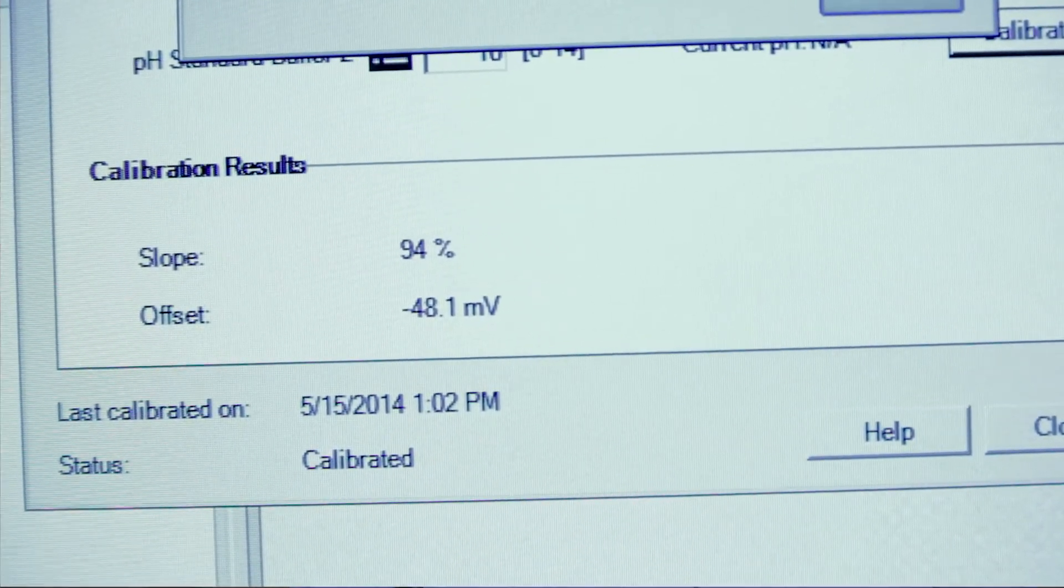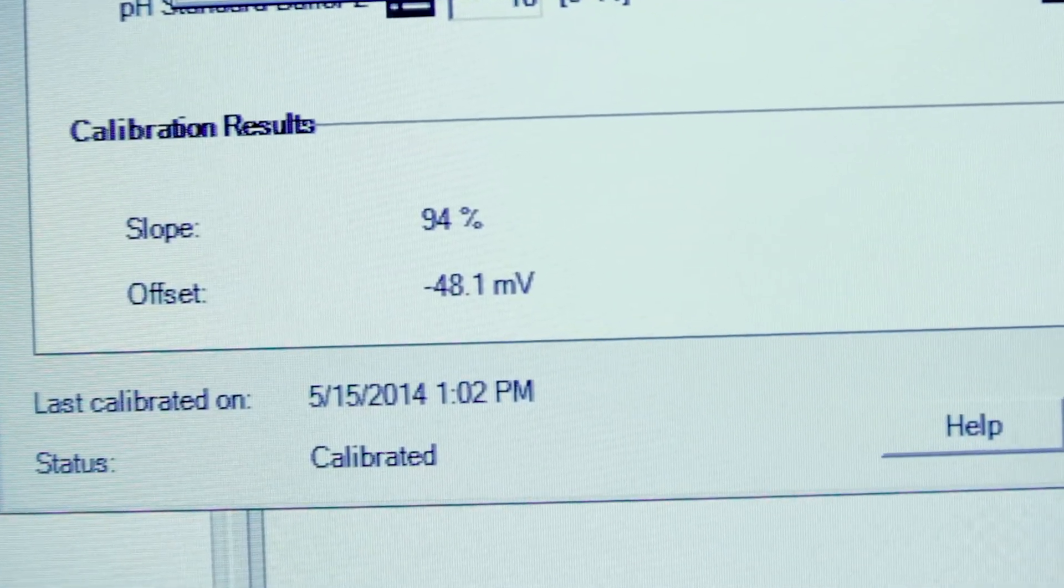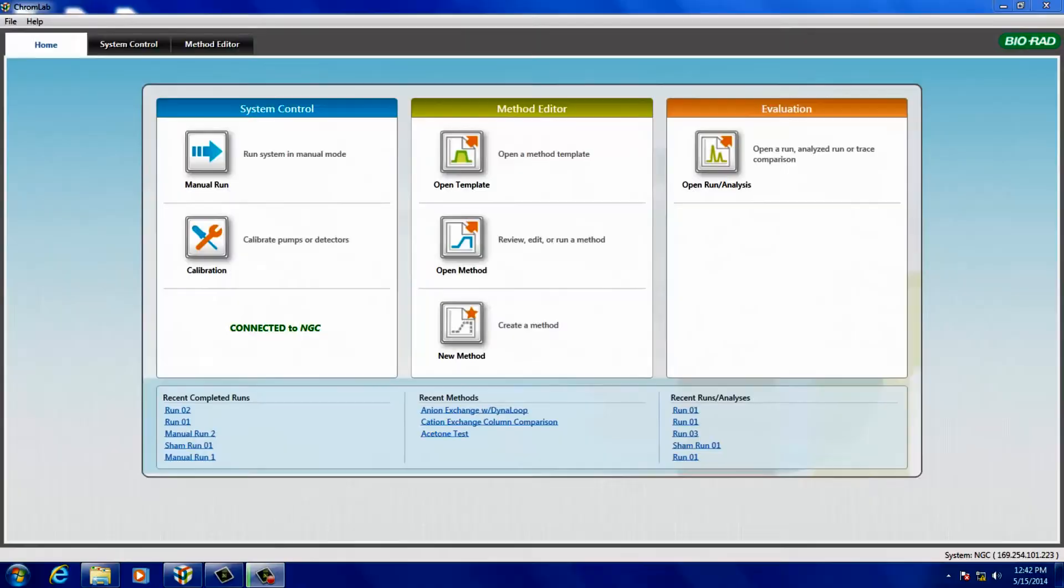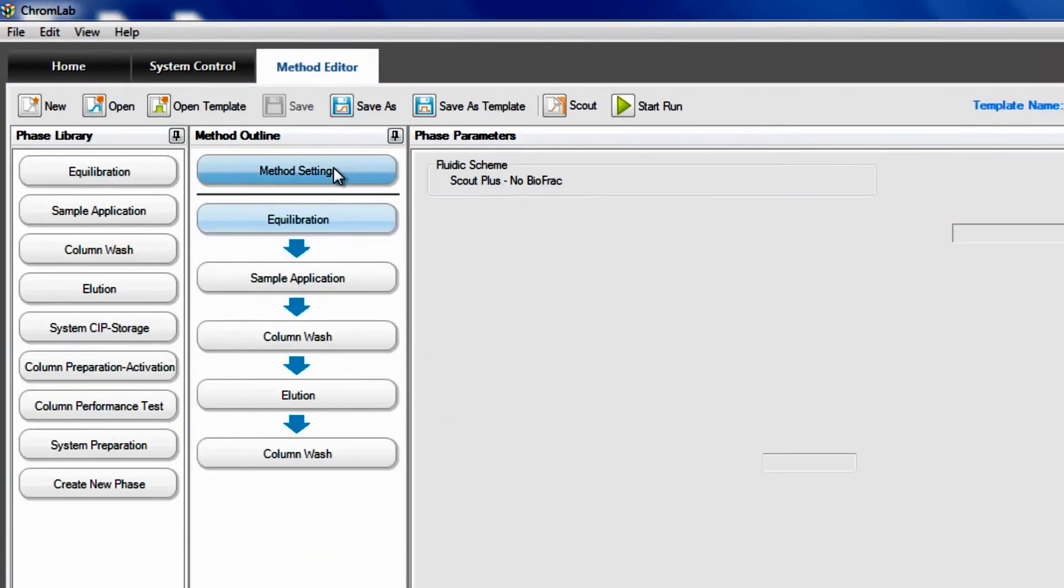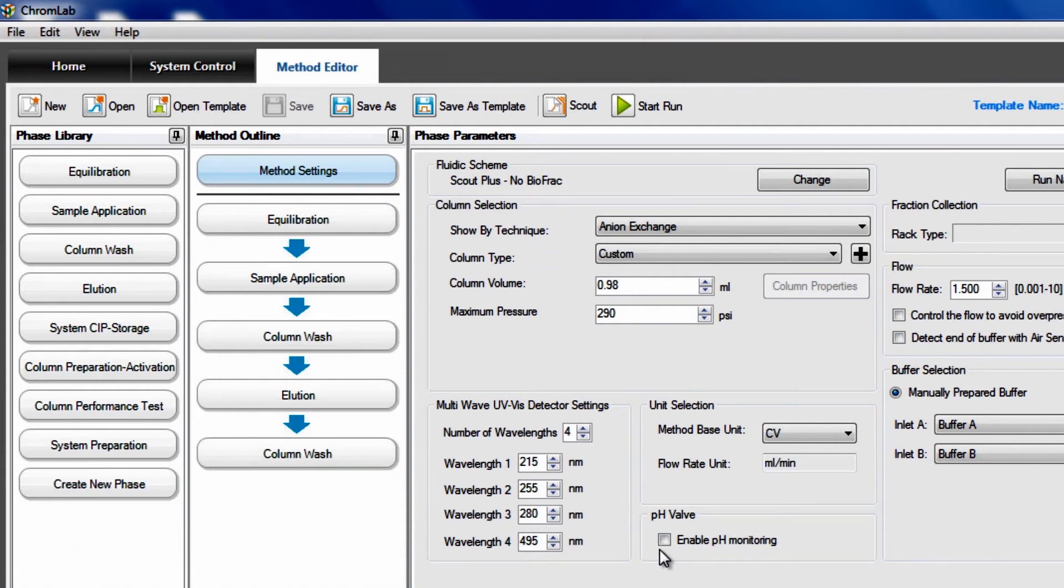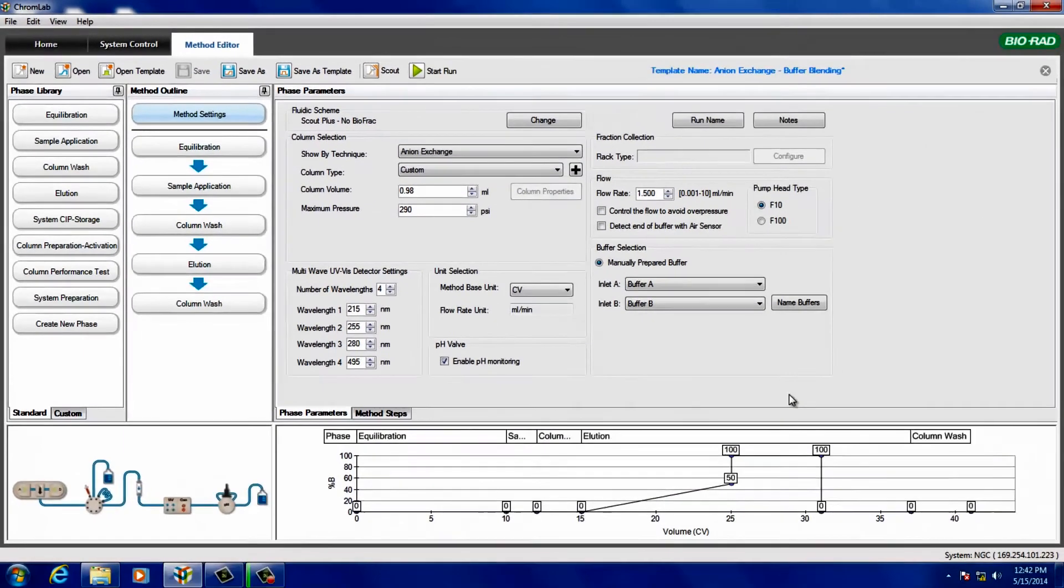When you are finished with the second solution, verify that the status at the bottom of the dialog box shows Calibrated. Now using the Method Editor, select Enable pH Monitoring under Method Settings to bring the pH probe in line or deselect the option to bypass the probe.